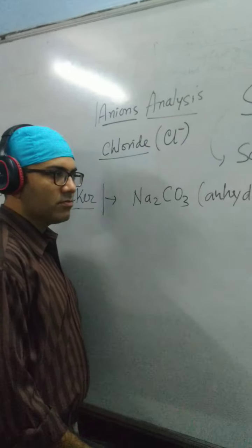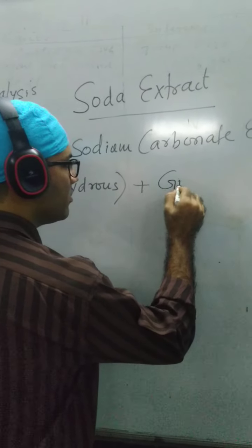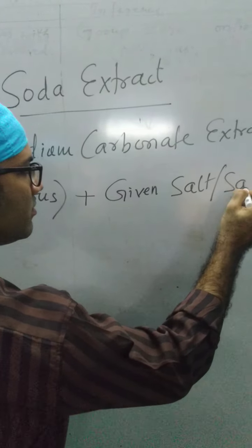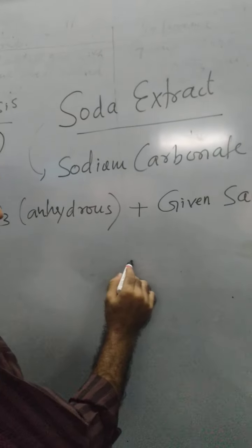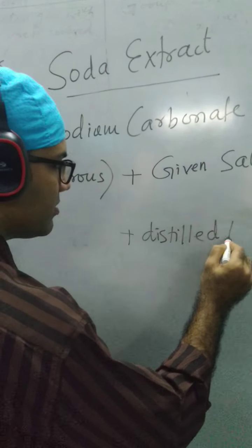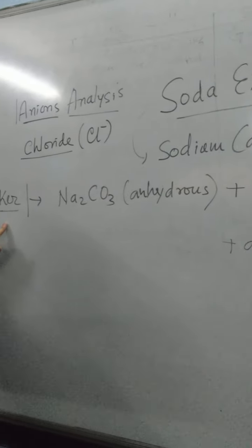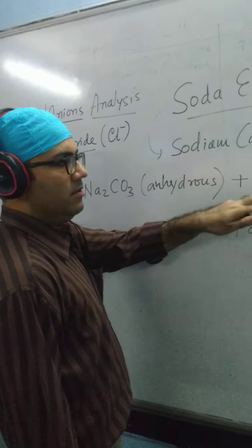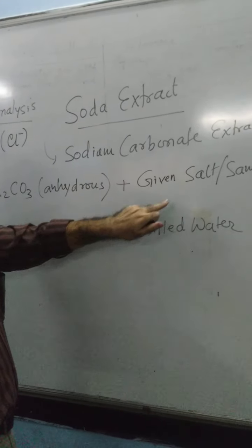To this, we will add the given salt or sample, and finally distilled water.